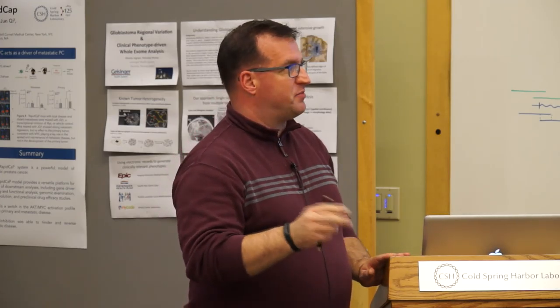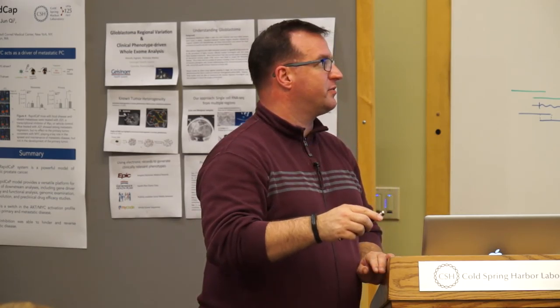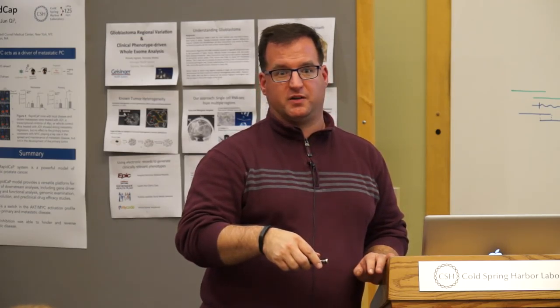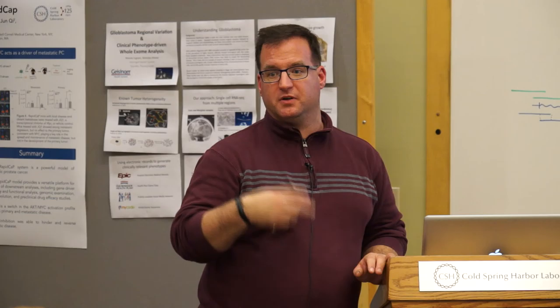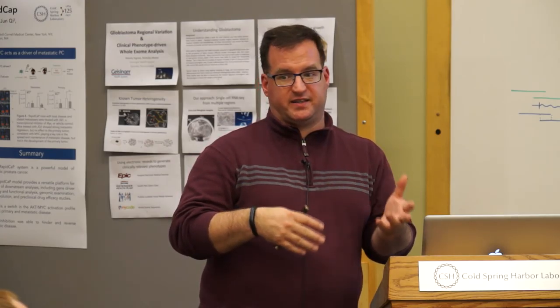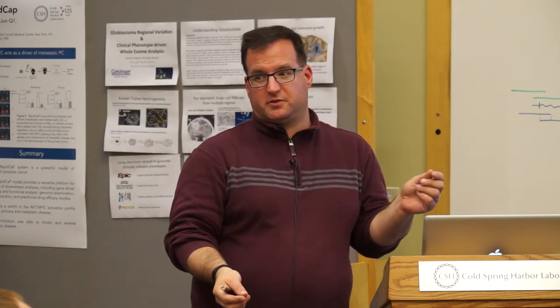So once you've loaded sample onto this, the sample is on there. Once one piece of DNA is done going through this pore, another piece of DNA can come along later and go through that pore. So each of the pores is essentially reusable for some amount of time, and you can just keep sequencing. There are no reagents, right? We're not doing any sequencing by synthesis or sequencing by hybridization. We're just observing the molecules.